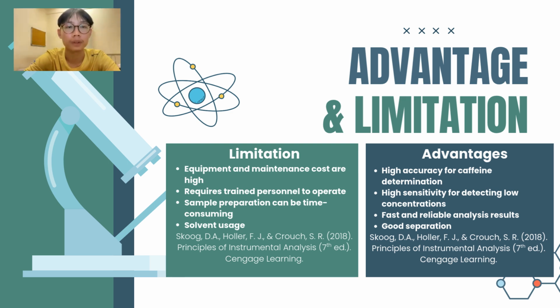However, HPLC also has some limitations. The equipment and maintenance costs are relatively high compared to other analytical methods. In addition, trained personnel are required to operate the instrument correctly. Sample preparation may also take time, and solvents used during analysis can increase operating costs and chemical waste production.